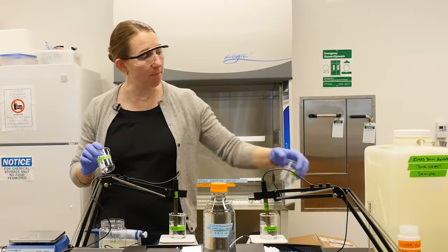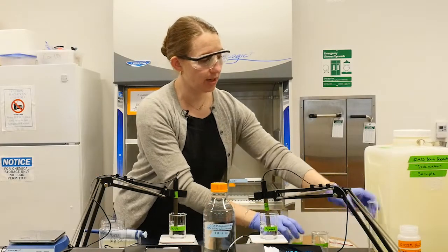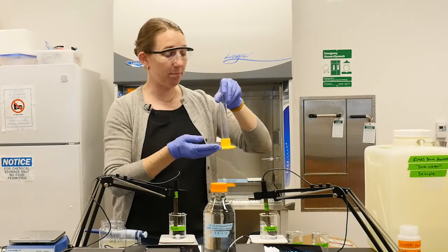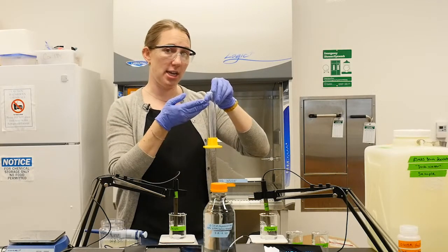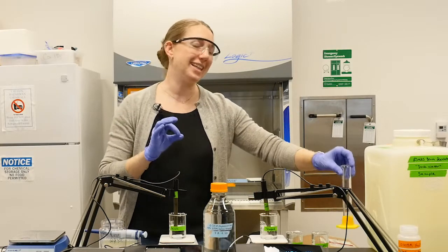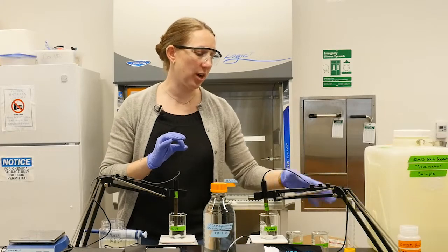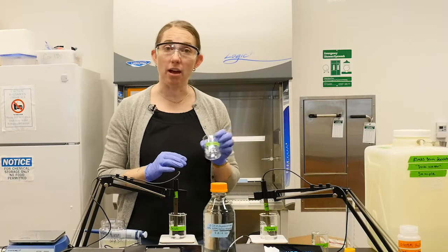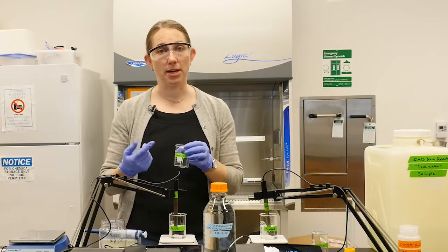So we're going to measure it using a graduated cylinder. We're going to put a 50 milliliter sample for both our seawater and our standard in here. But we want to be really accurate with this volume, and graduated cylinders only have mediocre accuracy. So we're going to weigh our sample as a more accurate way to measure that volume.